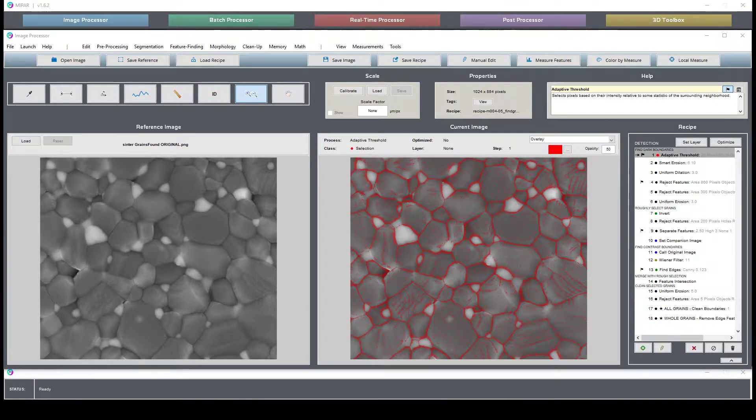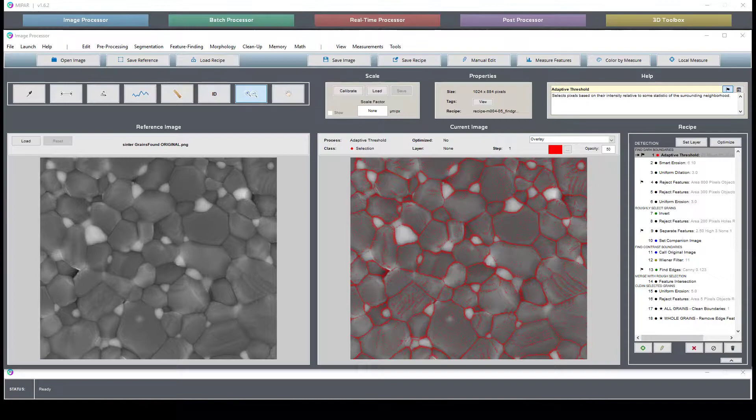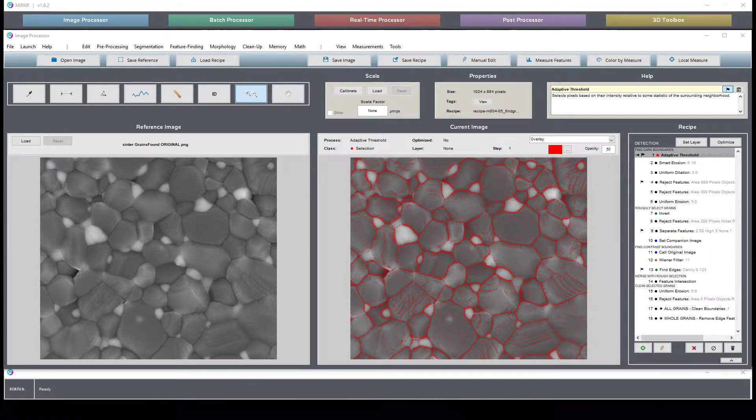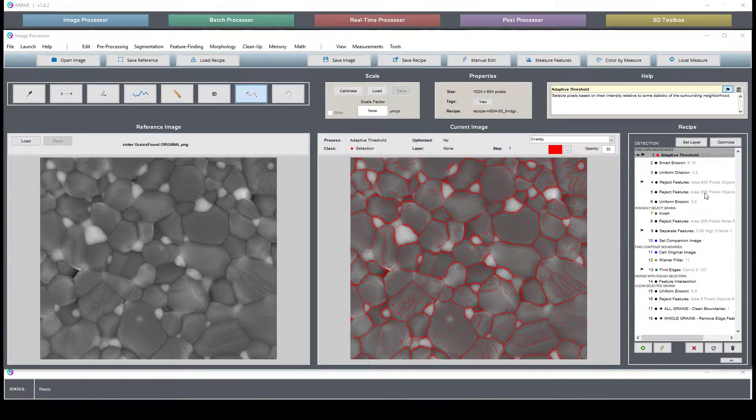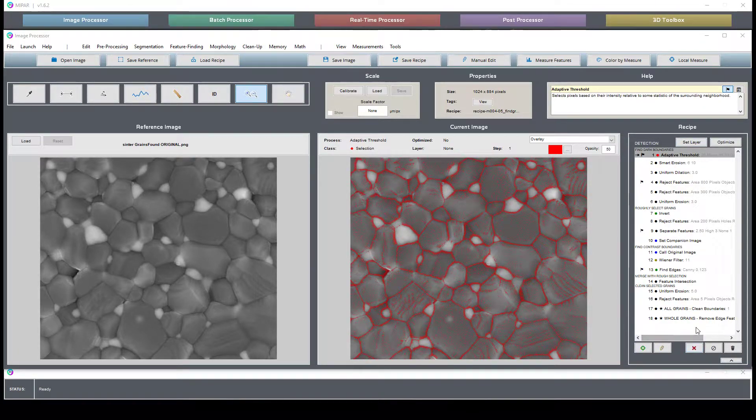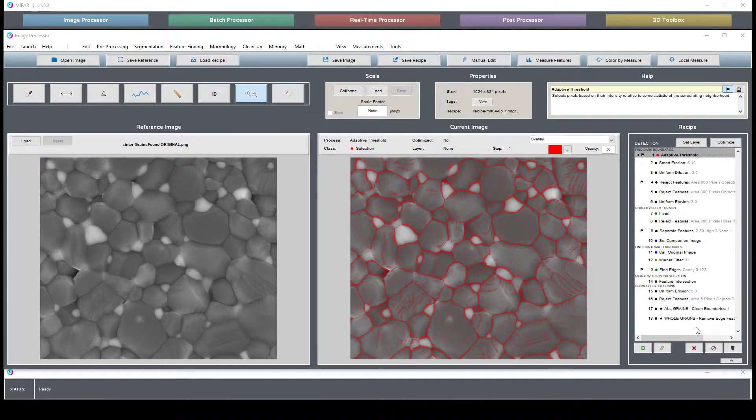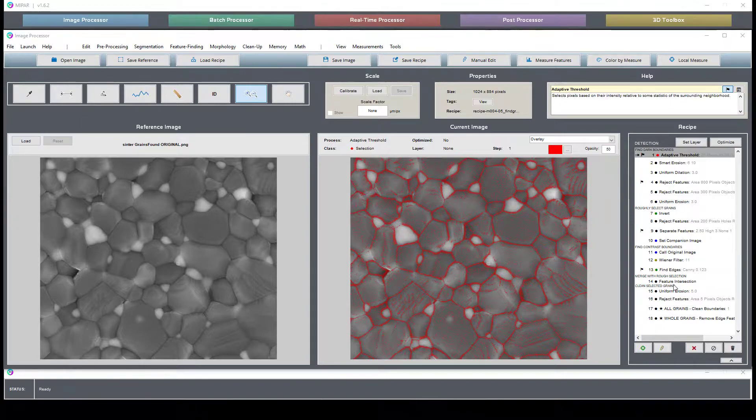This is a short video outlining the grain segmentation one recipe that is found on our recipe store. This video goes into the approach that's taken in segmenting this image as well as some of the measurements we're generating, as well as how to interpret the segmentation.